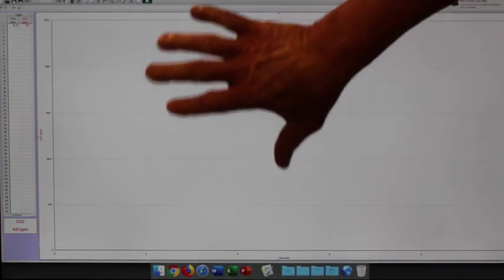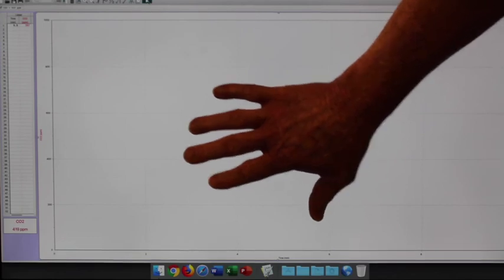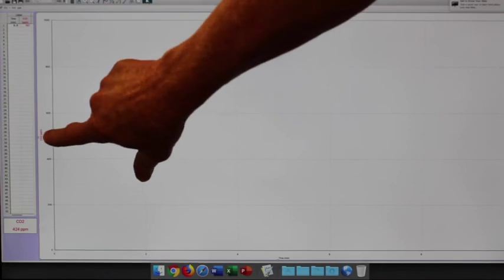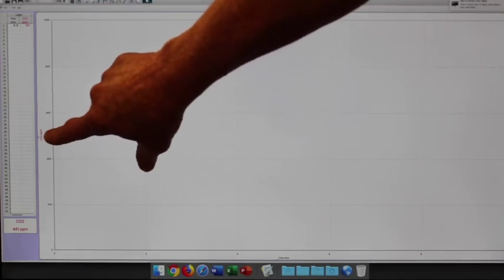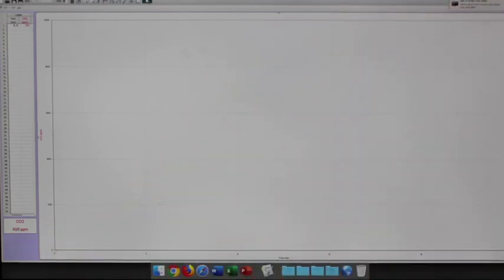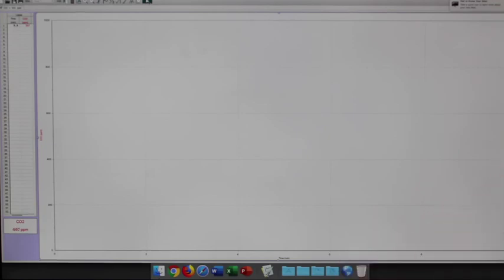And so if you look here, here is a graph. Okay, we have our y-axis being CO2 parts per million. So we're going to be looking at CO2. Here's a live reading of CO2. We have about 454 in the chamber right now. Down here, our x-axis is minutes.